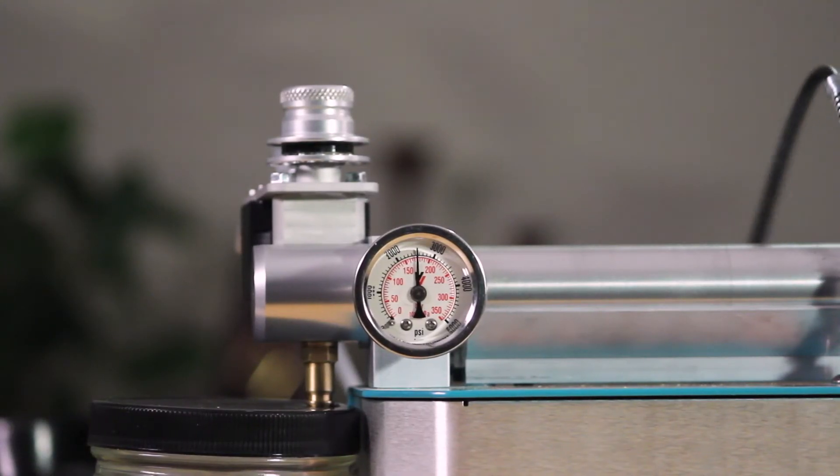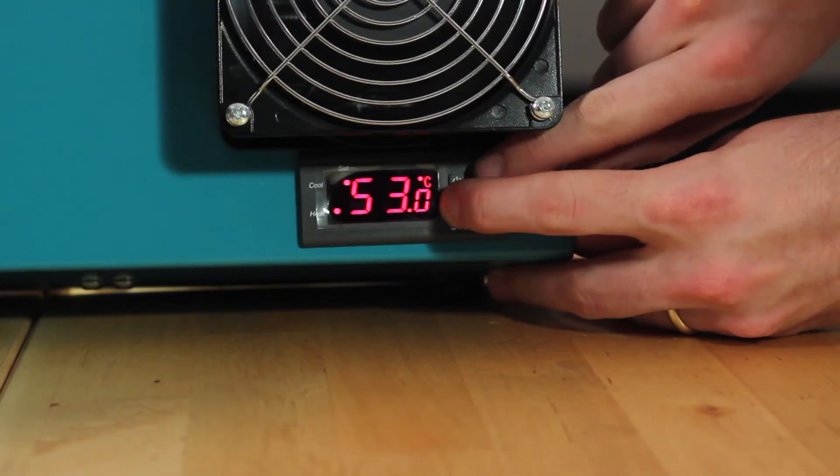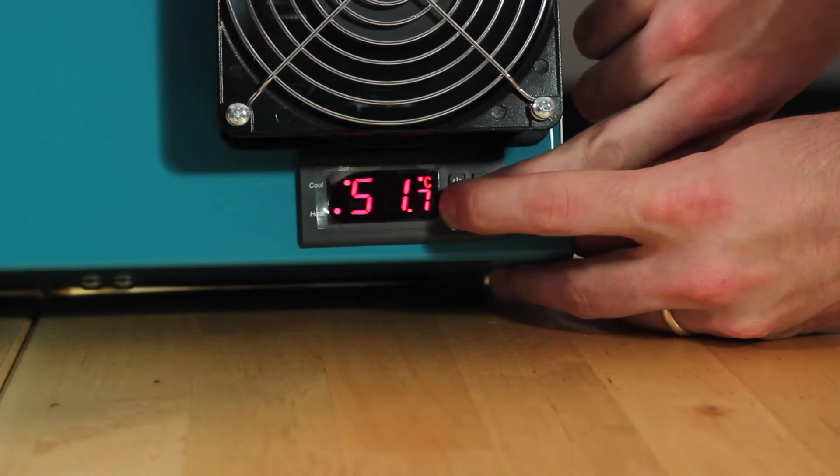Designed to run fully supercritical, the Super C can run anywhere between 800 psi and 4500 psi, and the temperature is controllable from ambient temperature up to as high as 90 degrees Celsius.